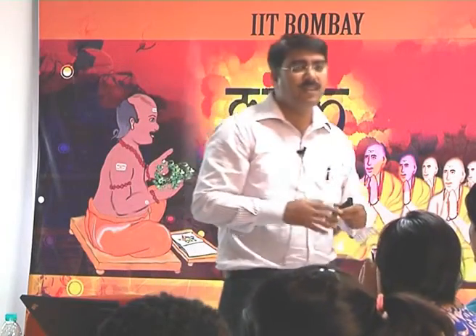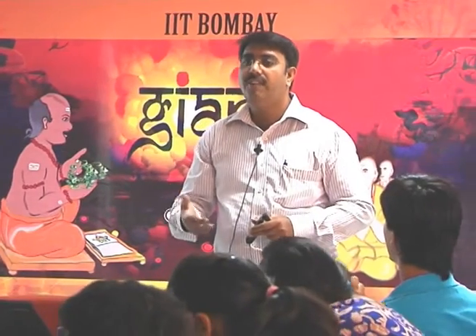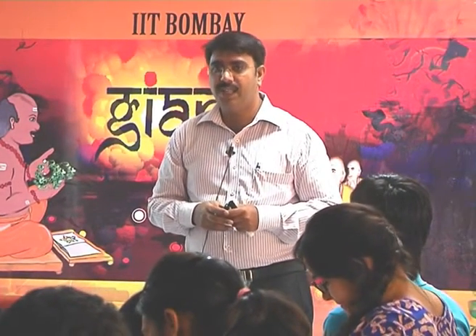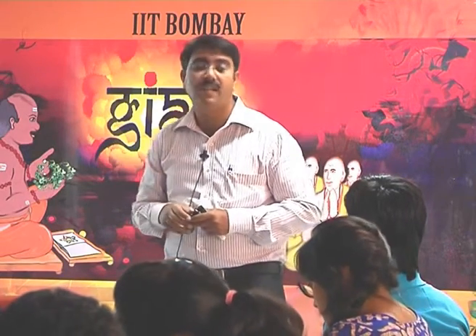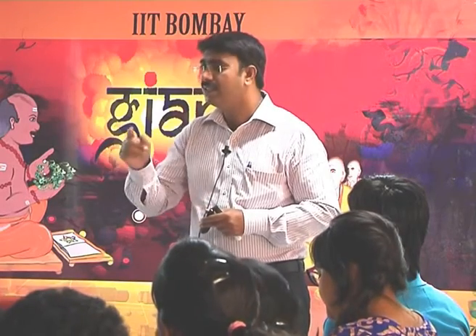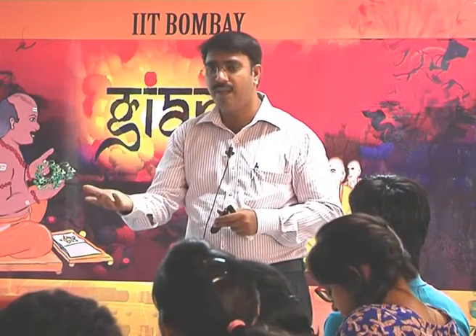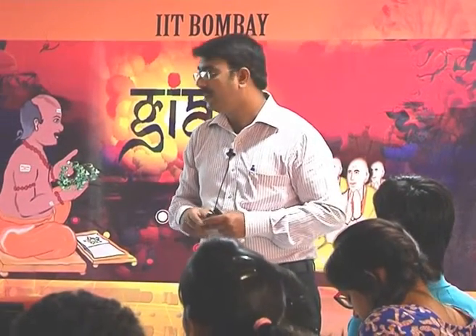That is the advantage. In case of SPR also, people are regenerating. But if something goes wrong with the SPR chips, you have to throw away the complete sensor. That sensor costs something like $150 to $200 depending upon the chemistry you are buying. Here we are providing 96 sensors, so 96 different experiments you can perform. That is the advantage.